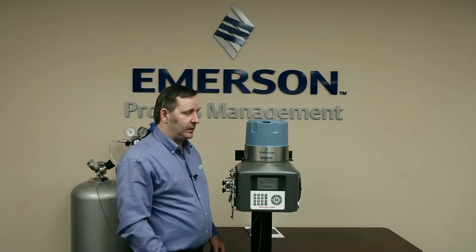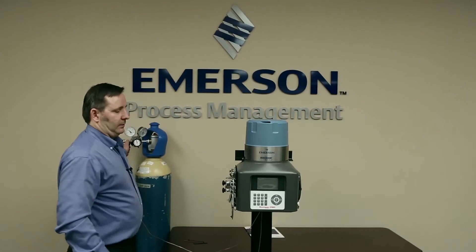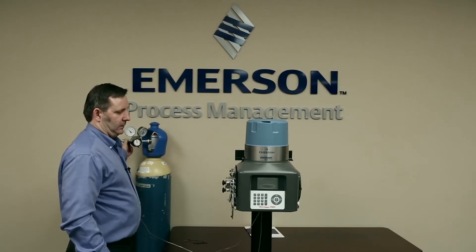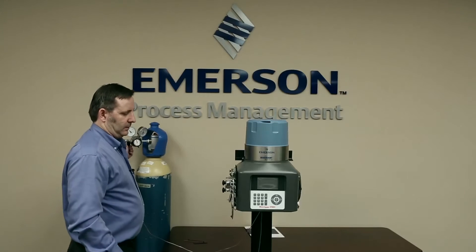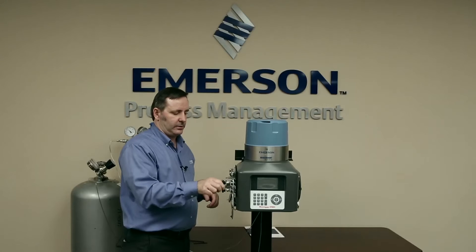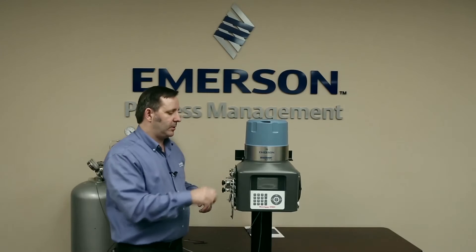And now we're ready to turn the GC back on. But before we put power on, we're going to turn our carrier gas back on, and our calibration and stream gases. And now we turn power back on.